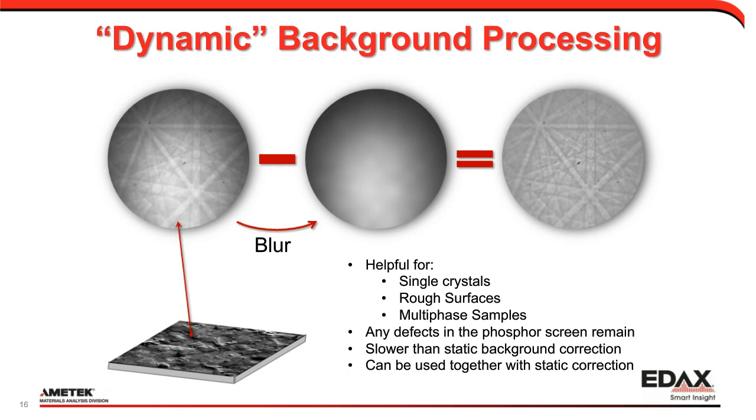Actually, another good question. Do phases that have CL cause problems for lightly scratched phosphors? I can't say I've actually seen this, but let's think about this. Cathodoluminescence is basically light given off by your samples. If I have a lightly scratched phosphor, the light can start to get through that scratched area. In general, it's not usually that strong that I have to worry about it. It also depends on the geometry of your scratch.